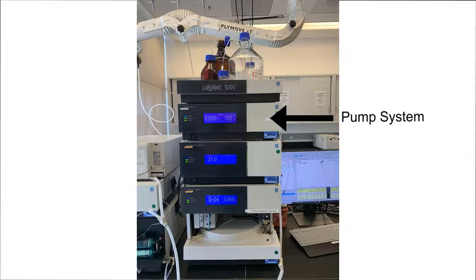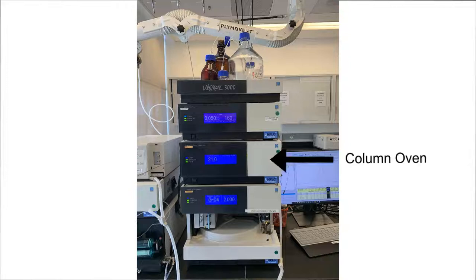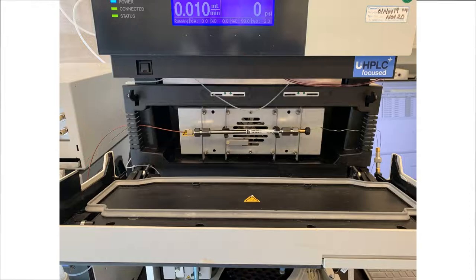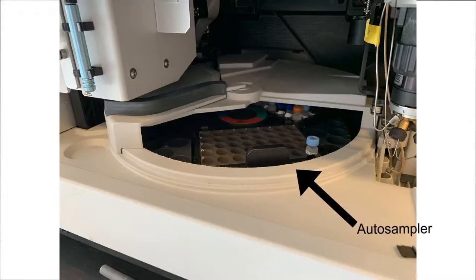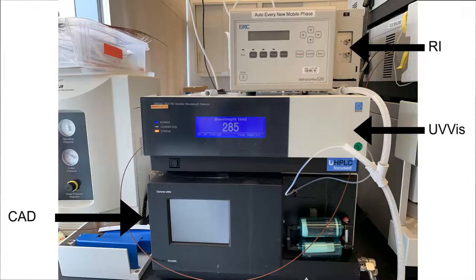Below the pump system is the column oven, where usually sits the column. Next, we have the autosampler. This system uses a needle to draw samples from the HPLC vials, and the mobile phase carries the sample towards the column where the separation of analytes takes place. Finally is the detector. The detector can be RI, UV-Vis, or CAD, depending on your application.